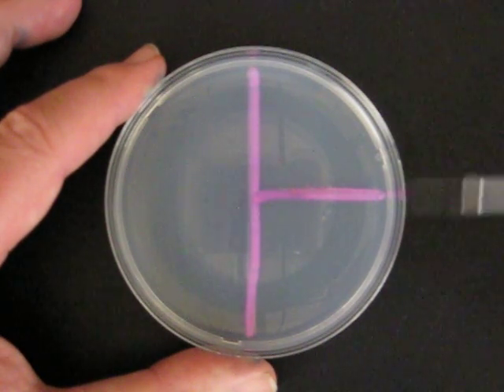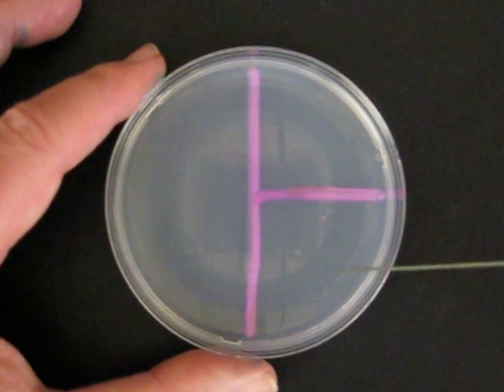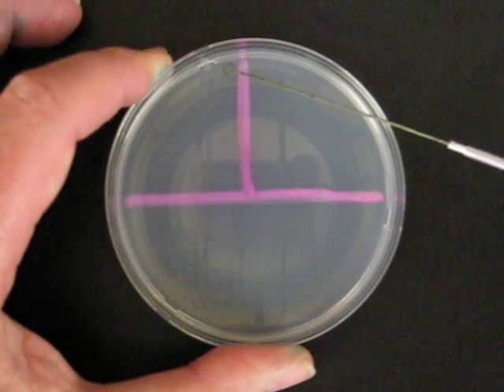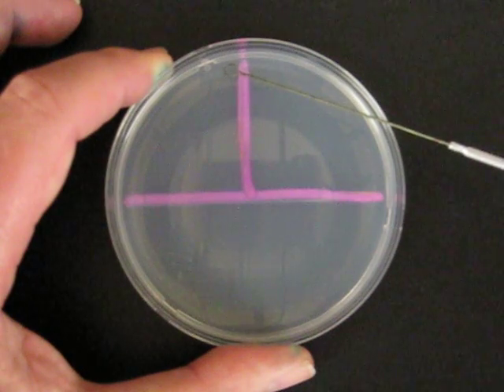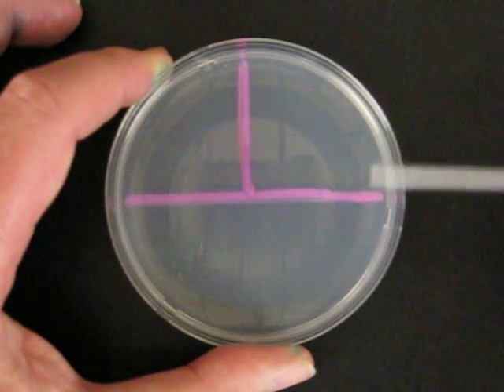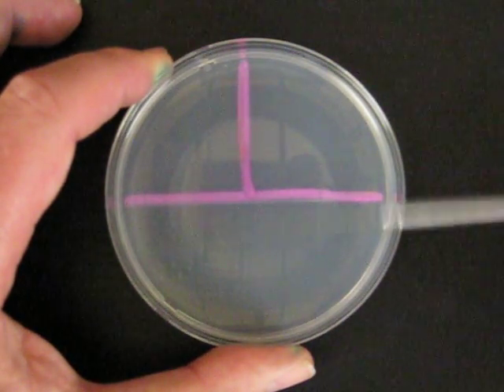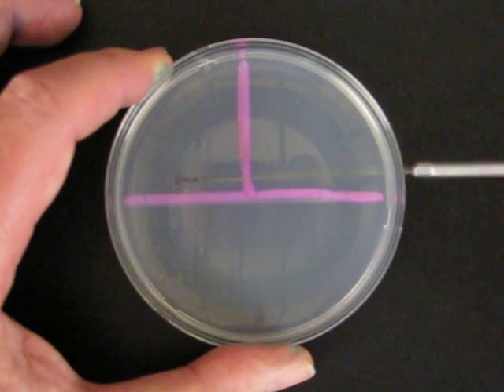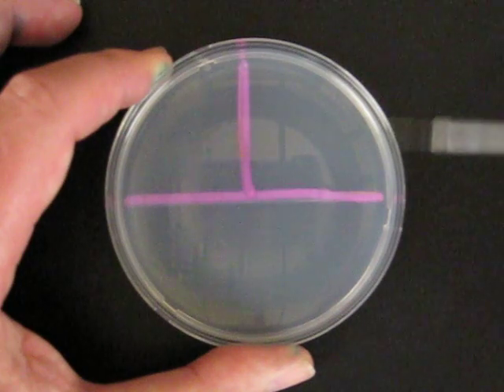The loop is carefully flamed to get rid of excess organisms, and the plate is rotated a quarter turn counter-clockwise. We can cool the loop by touching it to the medium. The inoculum for the second phase of streaking comes from the organisms which had been deposited in the first phase.